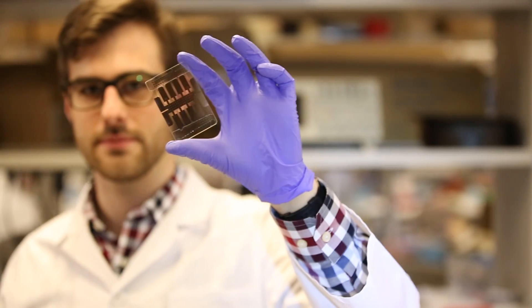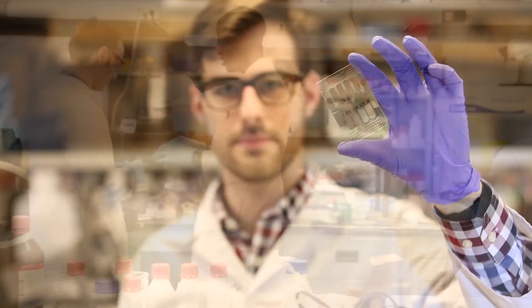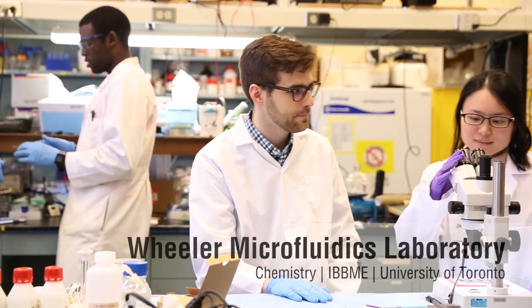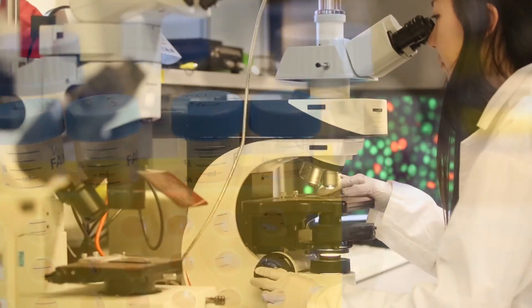What if you could shrink down an entire lab to something the size of a credit card? Here in the Wheeler Lab at the University of Toronto, we focus on miniaturizing chemistry and biology.